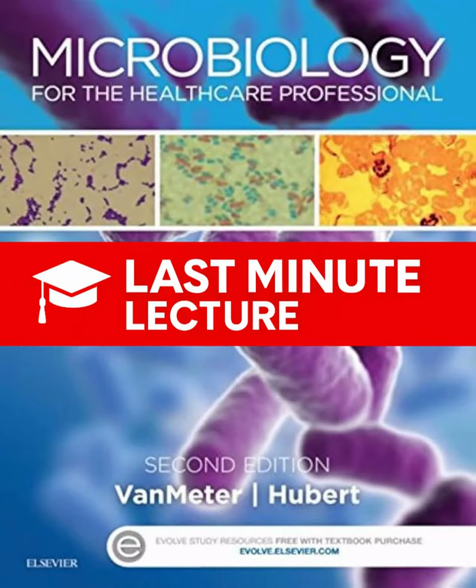But the really informative stains are the differential ones, right? Like the Gram stain. Oh yeah, differential stains are huge. They use multiple dyes to tell different types of bacteria apart. And the Gram stain is the king. It's usually the first big test run on an unknown bacterium. It separates almost all bacteria into two big groups: gram-positive, which stain purple or blue, and gram-negatives, which stain pink or red. And it all comes down to their cell wall structure.